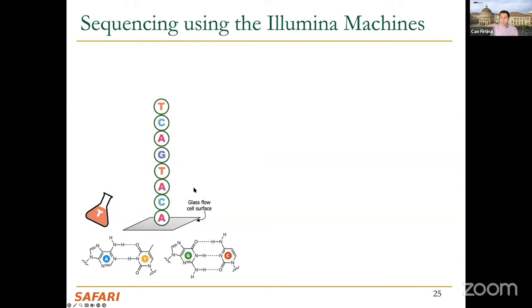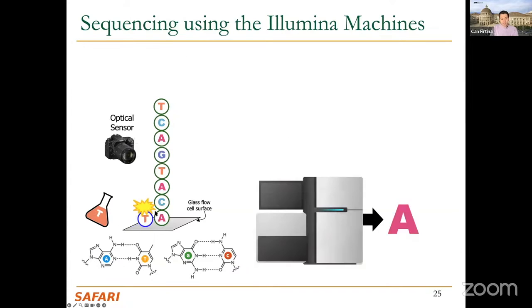There are a bunch of nucleic bases floating in a free form. They are everywhere, essentially looking for someplace to attach. This is a single T. Once all of these ACTGs are floating around, assume that now we have a T somewhere here.